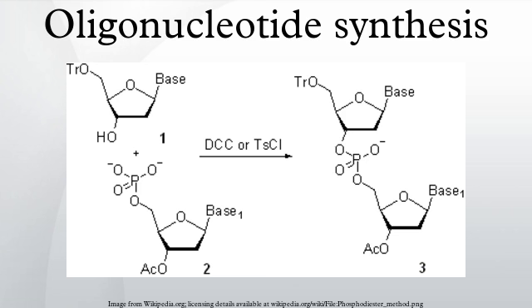Solid supports. In solid phase synthesis, an oligonucleotide being assembled is covalently bound, via its 3'-terminal hydroxy group, to a solid support material and remains attached to it over the entire course of the chain assembly. The solid support is contained in columns whose dimensions depend on the scale of synthesis and may vary between 0.05 milliliters and several liters.